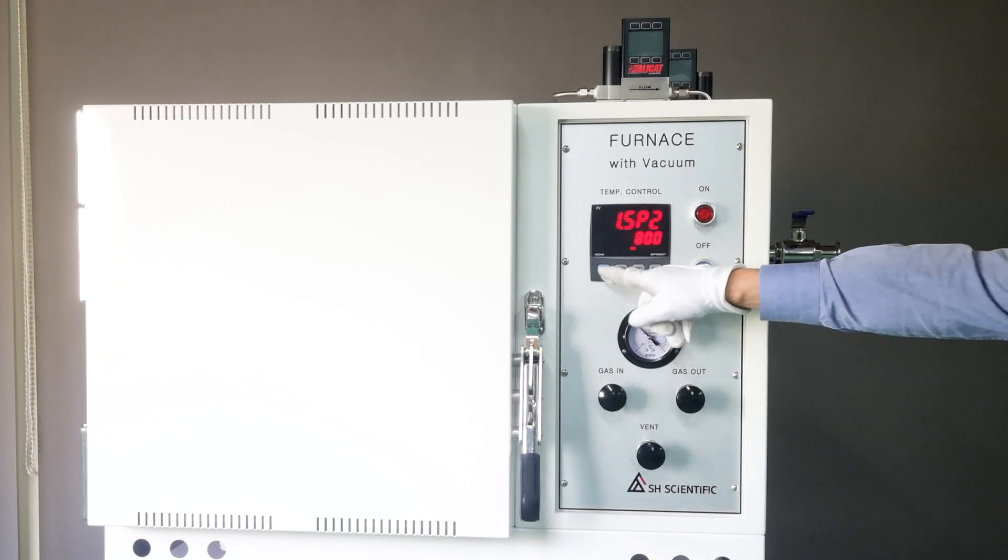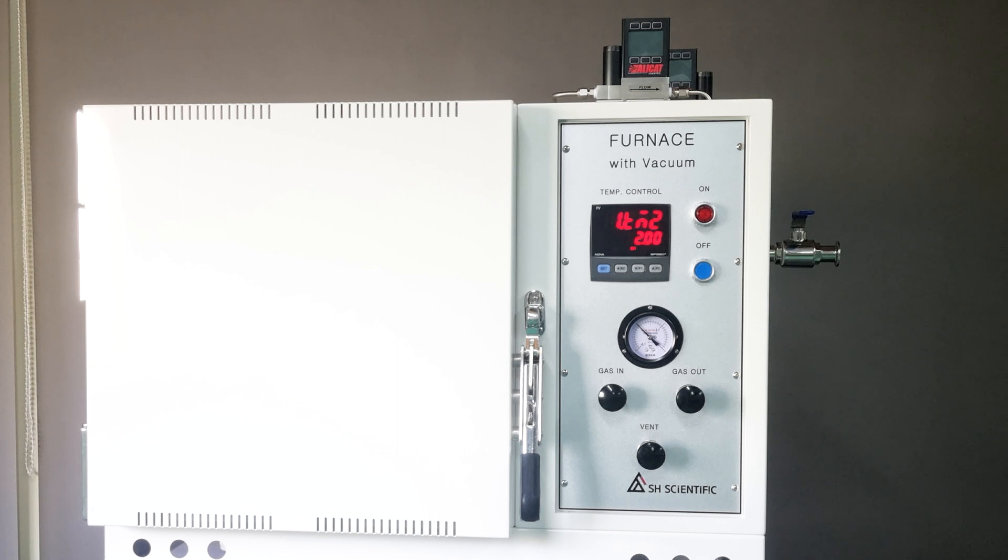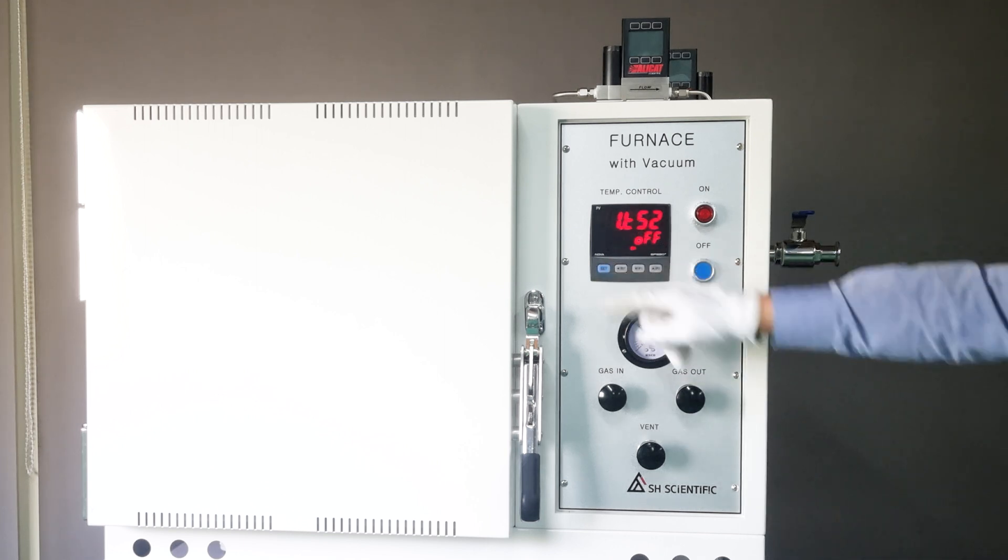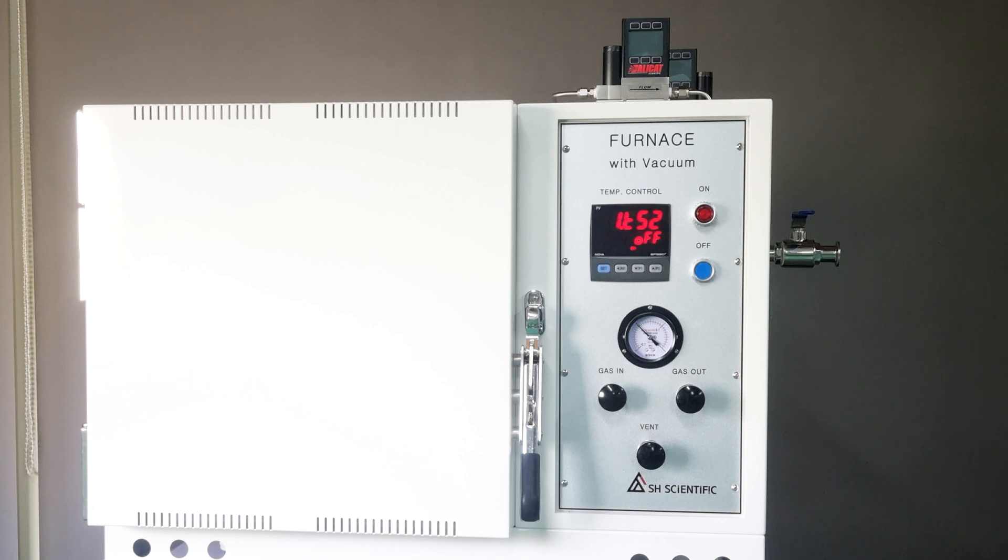Now, click set, and you'll see 1TM2. I've entered 2 hours here. So once the furnace reaches 800 degrees Celsius, it will hold for 2 hours. Hitting set again brings up 1TS2, which we don't use, so we'll keep it off.